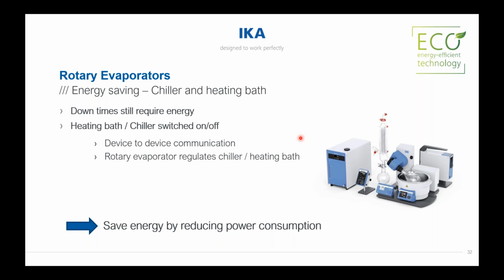Energy saving is of course also very interesting, especially nowadays, because everyone needs to be environmentally friendly. We have targets to achieve less carbon dioxide formation, so we also need to save energy if it is possible. And the problem is, sometimes you use these rotary evaporators, but you have a lot of downtimes in between, where the heating bath has reached its temperature, the chiller is turned on, but you actually don't even need it.